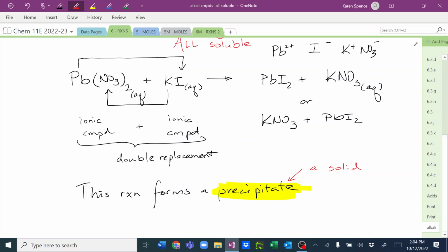Or we could use this little thing right here. Has anyone used one of these before? This is a centrifuge. It is a spinny thing. So if you would like to come and look closer at it, please feel free. I'll abandon the back of my desk.